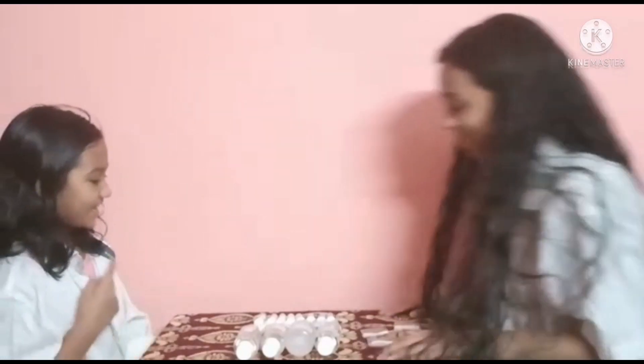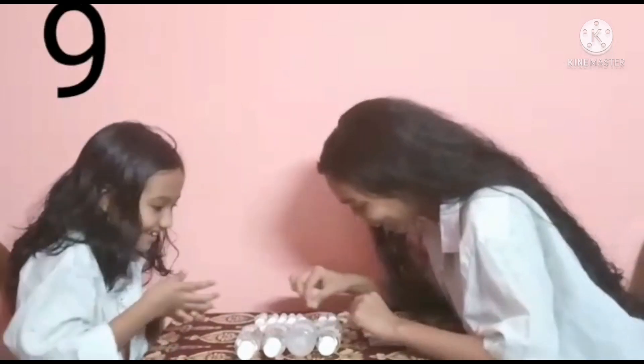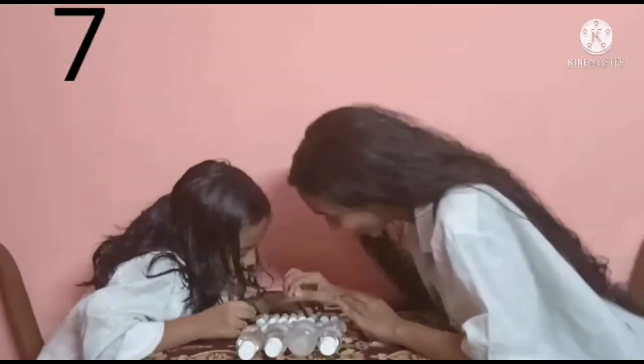Ready, steady, go! One, two, three, two, three, one, and go!